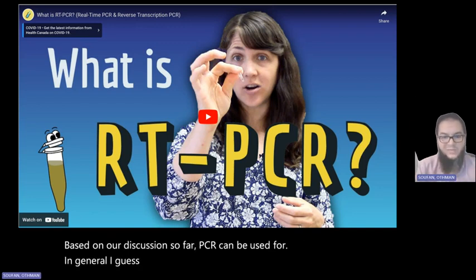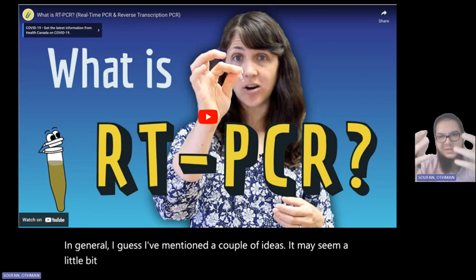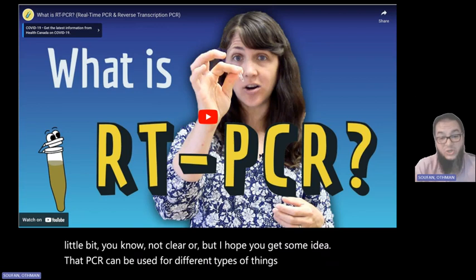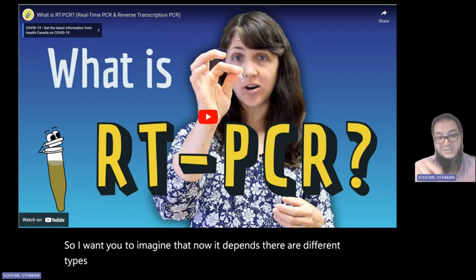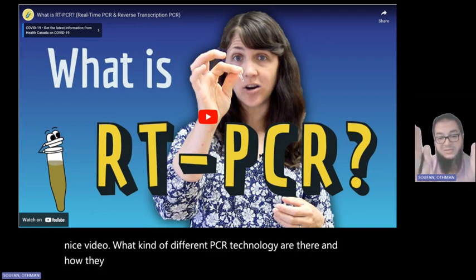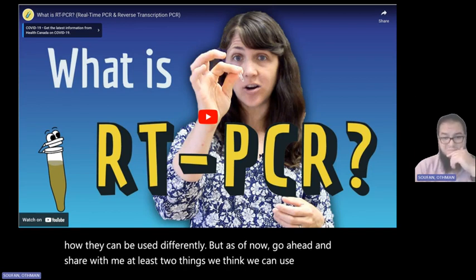I guess I've mentioned a couple of ideas. It may seem a little bit not clear, but I hope you get some idea that PCR can be used for different types of things as a technology. So I want you to imagine that. Now, it depends. There are different types of PCR, something that will be clarified as you watch this nice video, what kind of different PCR technologies are there and how they can be used differently. But as of now, go ahead and share with me at least 2 things you think we can use PCR for.